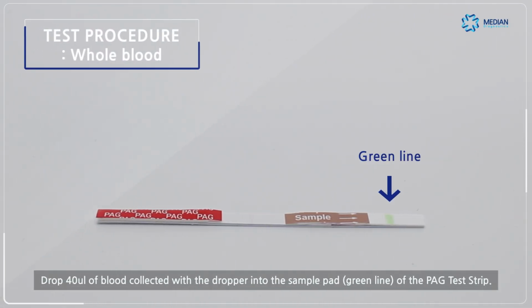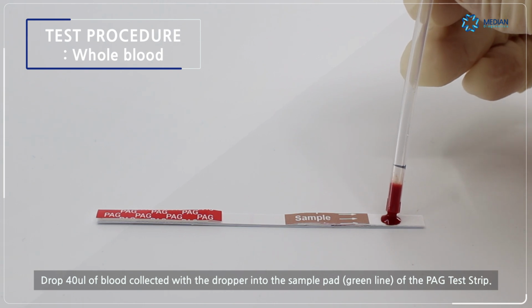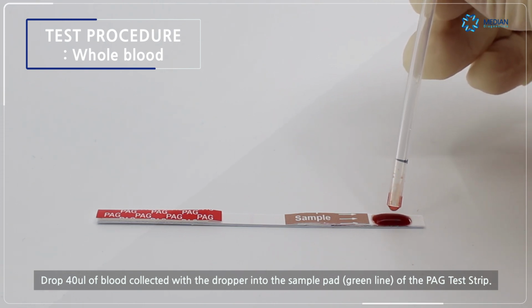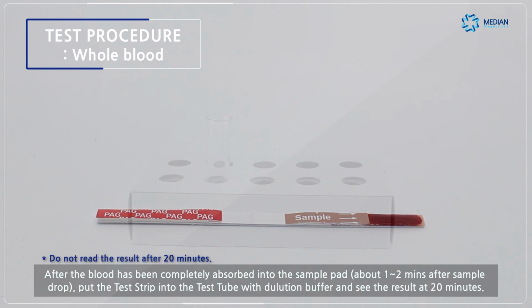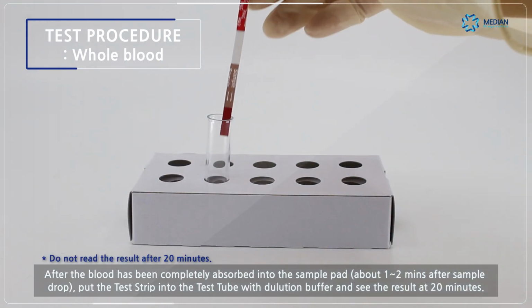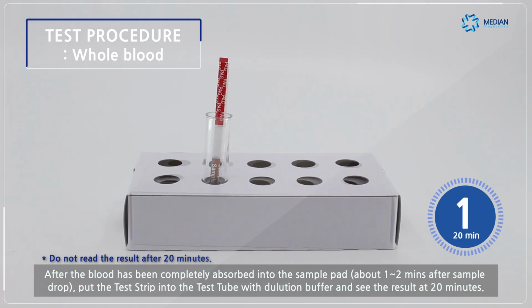Dispense 40 microliters of blood onto the sample pad at the green mark of the PAG test strip. Wait for about 1 to 2 minutes until the blood has been fully absorbed. Then place the test strip into the test tube containing the dilution buffer and check the result after 20 minutes.